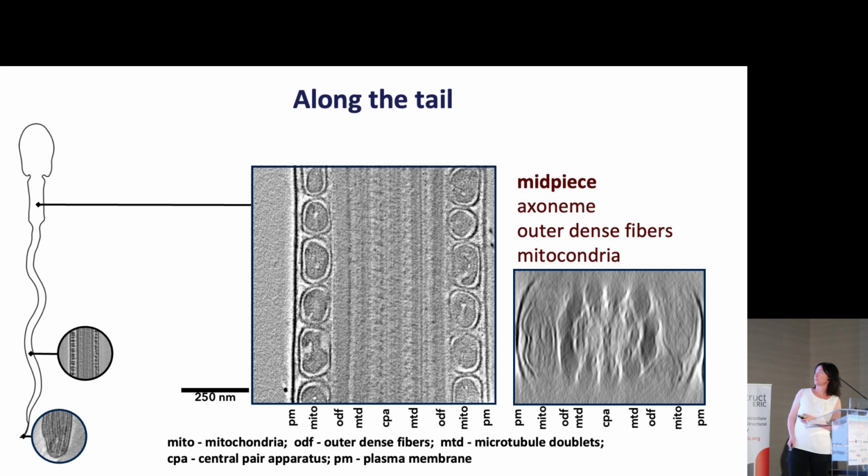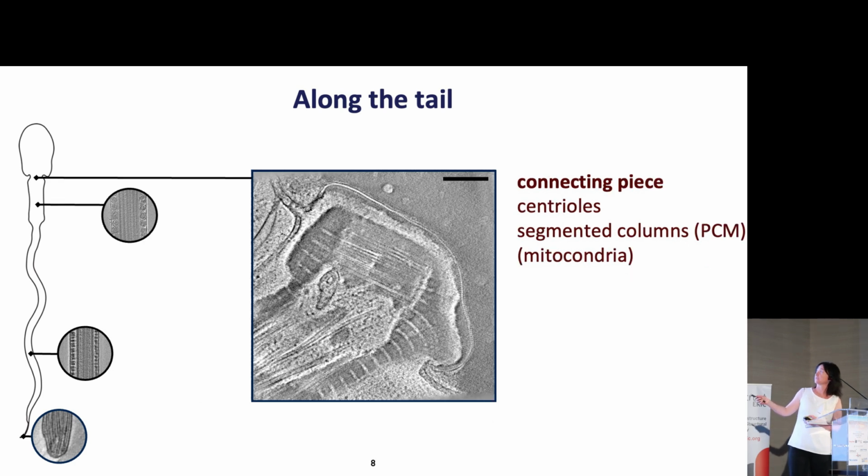And again, it's a tomogram, so I can play it too, so you can really see it's individual. It's not one mitochondria; it's individual mitochondria that wraps all around. And we can get even closer to the head. So this is where the head will be.